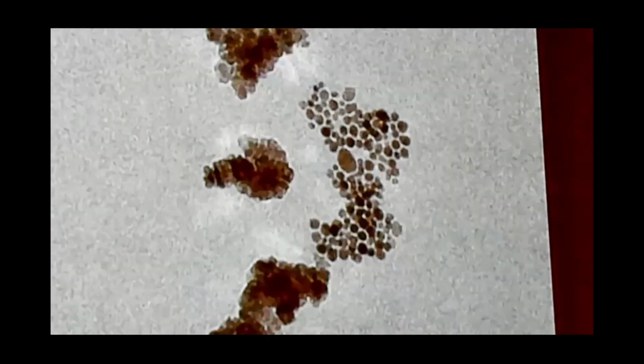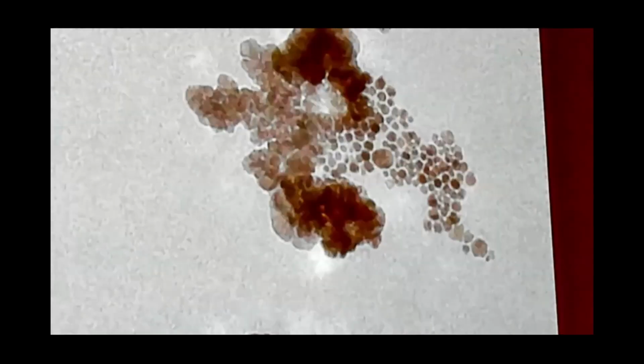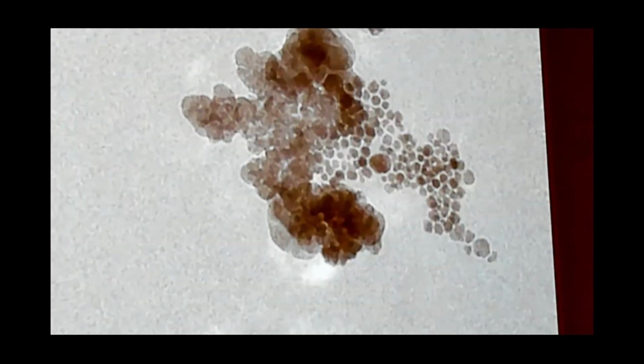These particles outside of those 8 to 10 nanometer gel particles that I showed you in the beginning, they are growing. And there are some of these that will grow out of solution. So if you look in this area, as I speed up the movie, you see something forming out of, quote, nowhere. So there's that particle that starts growing.